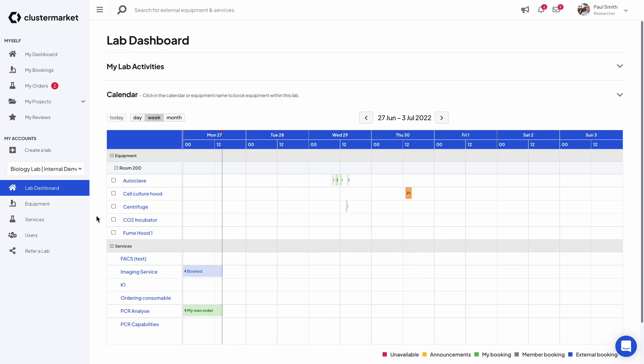Hi everyone and welcome to this short video on how to do recurring bookings using ClusterMarket. Obviously recurring bookings is a very important feature so you don't have to keep doing the same booking over and over again.